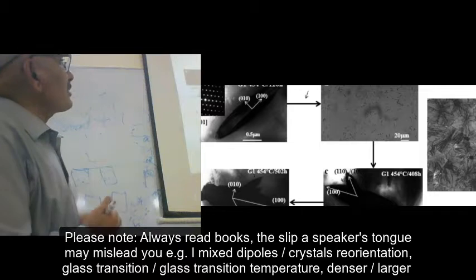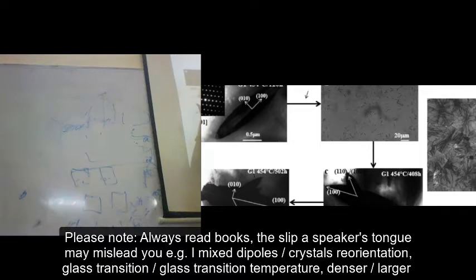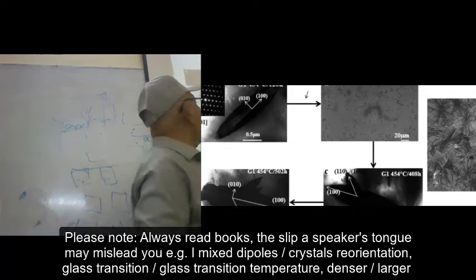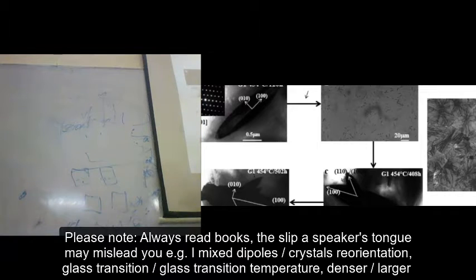What I was telling you, I saw this small crystal occasionally after 120 hours at this temperature. Then I went to 217 hours. So I increased the number of the same phase. Then I looked in the transmission electron microscope at how these crystals appear here, right? These are the various phases.